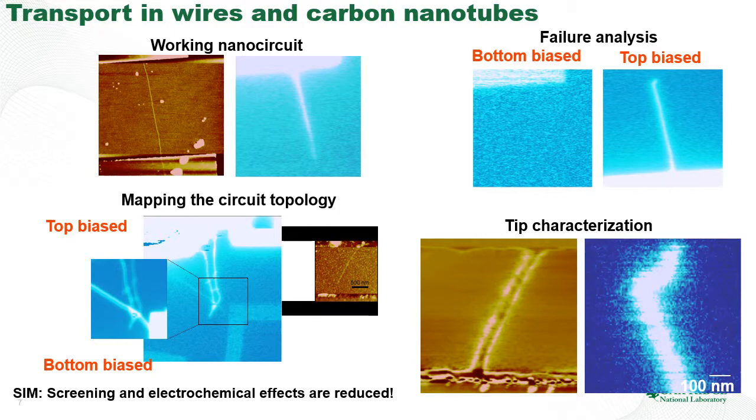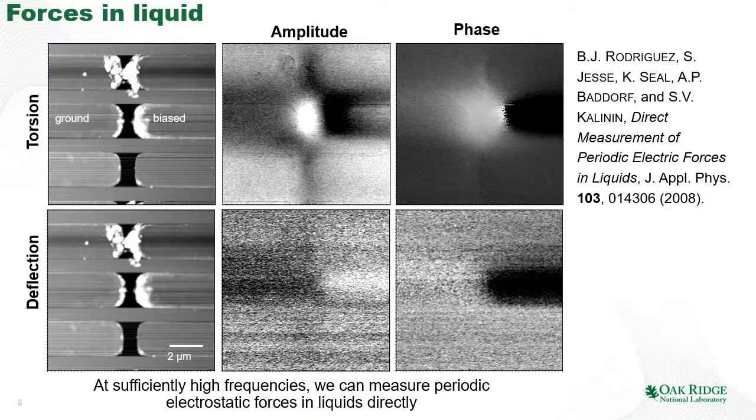However, in the impedance microscopy, this does not happen because application of the 100 kilohertz plus biases simply does not allow for ion injection and transport on the sample surfaces. So these observations, both the impedance microscopy and the PFM in liquid, suggest that we can try to run a similar measurement in the liquid environment.